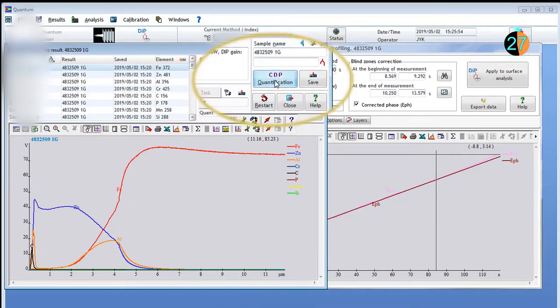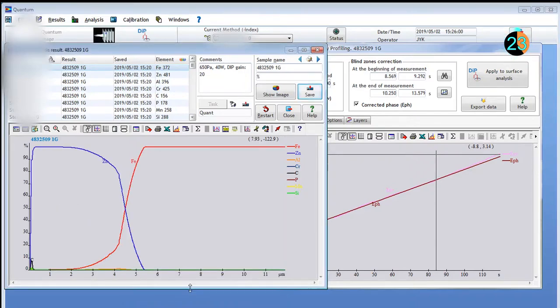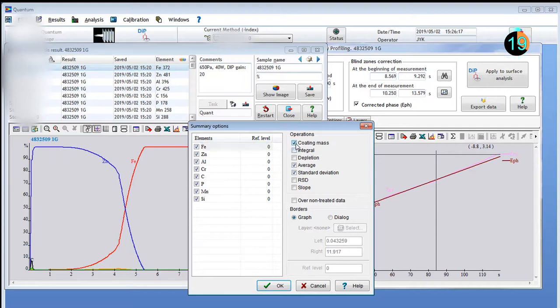With two additional clicks, the concentrations for each element are calculated, transforming the intensity as a function of time into concentration as a function of depth.